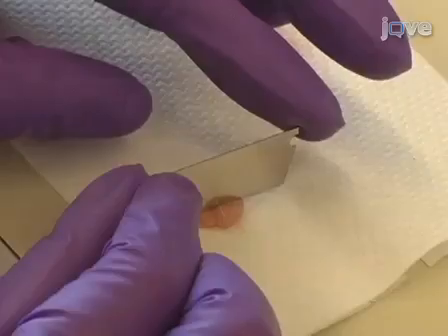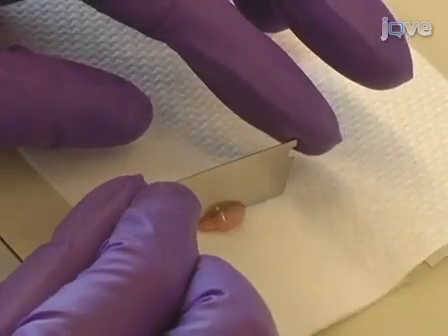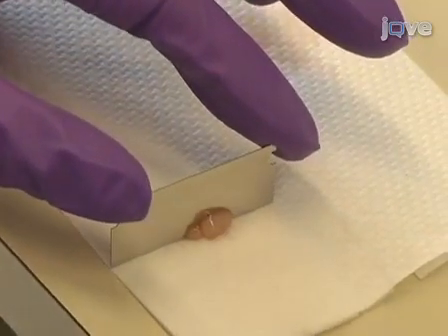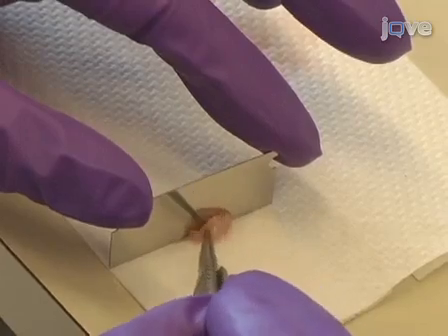Following dissection, use a razor blade to make a sagittal cut in one hemisphere to provide a flat surface for mounting on the vibratome plate. The rostral part of the cortex may also be cut.